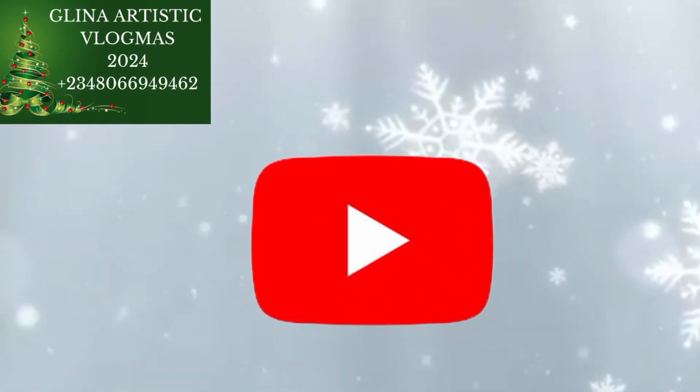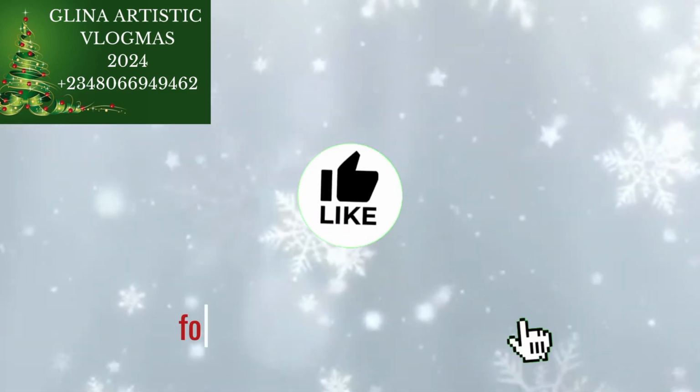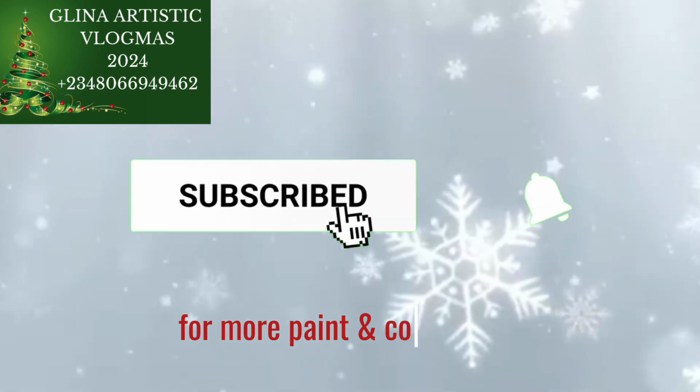Want to create paint that customers trust and love? It's all about quality testing and consistency. Today, I will show you the essential tests and techniques to ensure your paint meets professional standards every time.